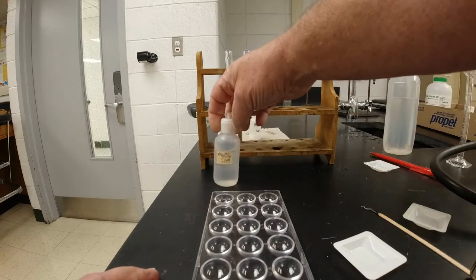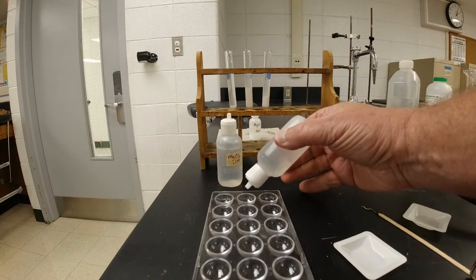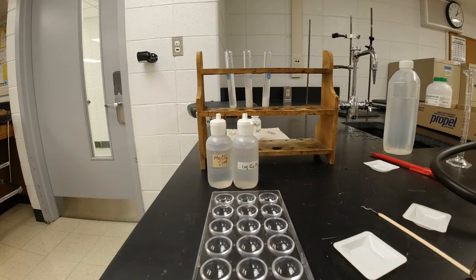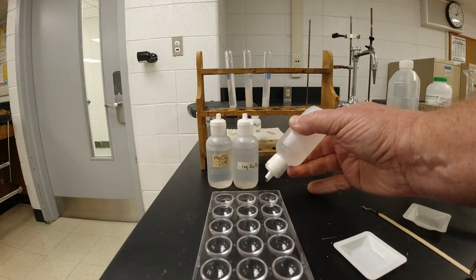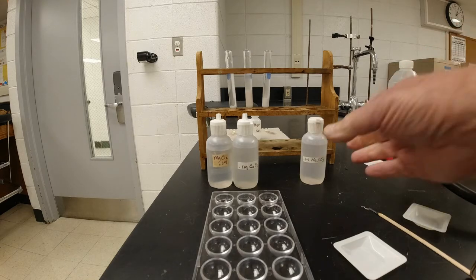So there's my magnesium chloride, MgCl2. I need 10 drops of calcium chloride. So 10 drops of calcium chloride. And then I need 10 drops of barium chloride. Now, what I'm going to add to each one of these is, if I read the directions, it says 3 drops of sodium carbonate.